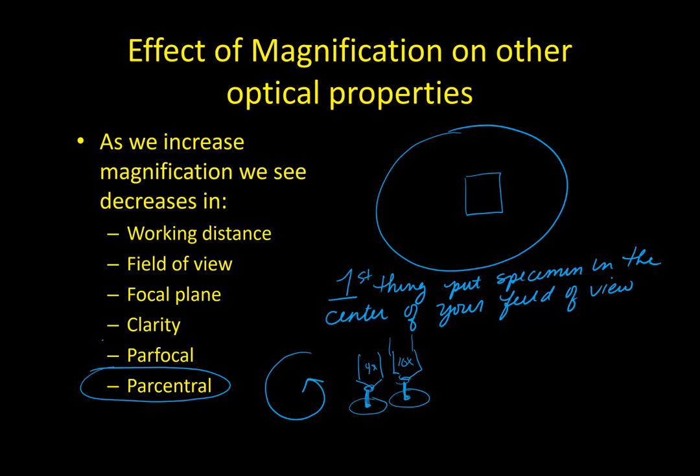That's parcentral. It means that it's completely in the same spot. It's still centered. You can still see it where you see it.